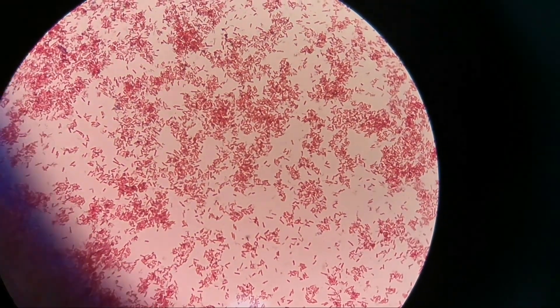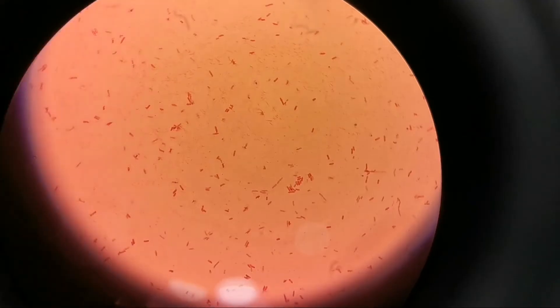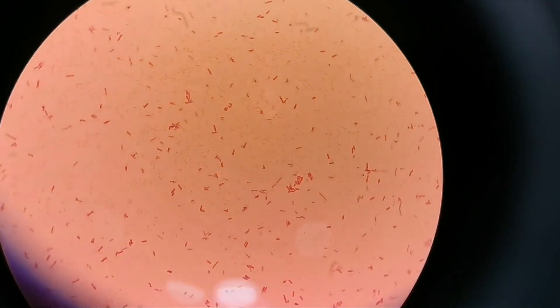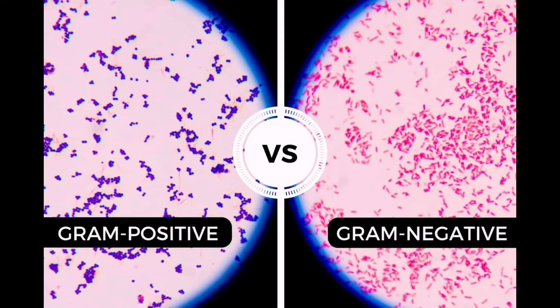On the slide where we did heat fixation, you can see the stain is very good and the bacteria adhere firmly on the slide. On the slide where we did not do heat fixation, look at the bacteria — it's not well stained, and we cannot see many bacteria because they were rinsed off during the staining process.